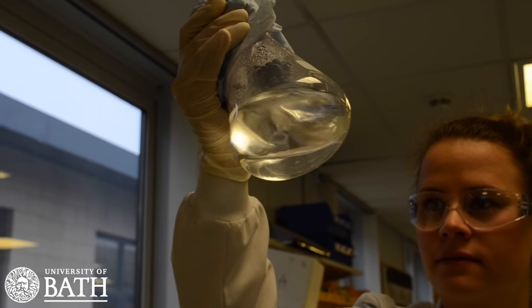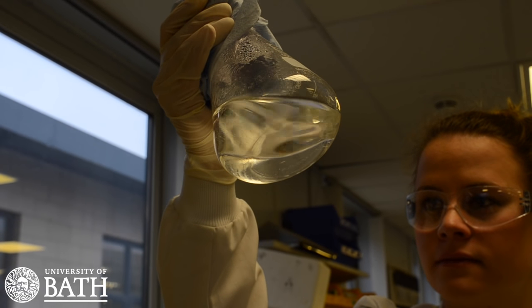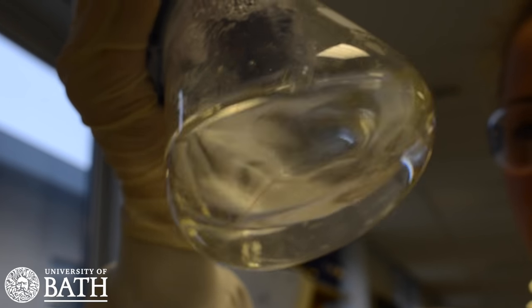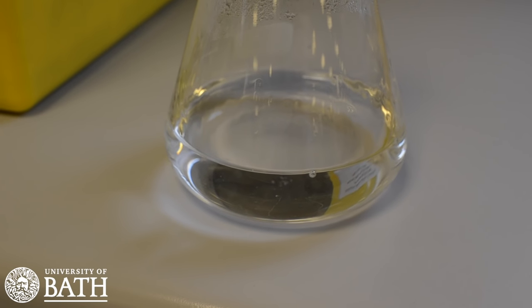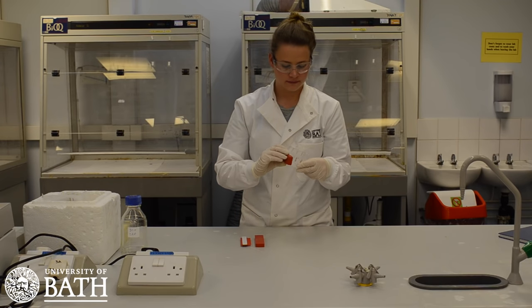When the agarose mixture seems to be transparent, it may be useful to hold the mixture up to a light to double check this. The mixture needs to be fully transparent before moving on to the next stage. When this is complete, you will need to create the agarose gel casting tray.